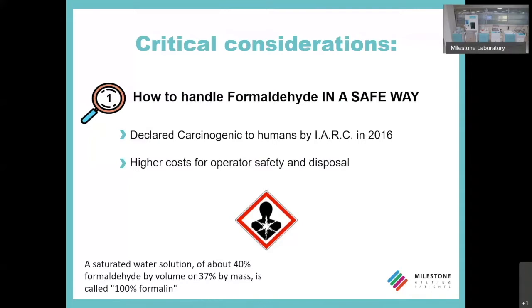for the histological diagnosis. Well, the first consideration is the formalin, because formaldehyde has been classified since 2016 by the International Agency for Research on Cancer as carcinogenic and mutagenic to humans. So formaldehyde, or formalin, basically a saturated water solution of about 40% formaldehyde, is basically 100% formalin.